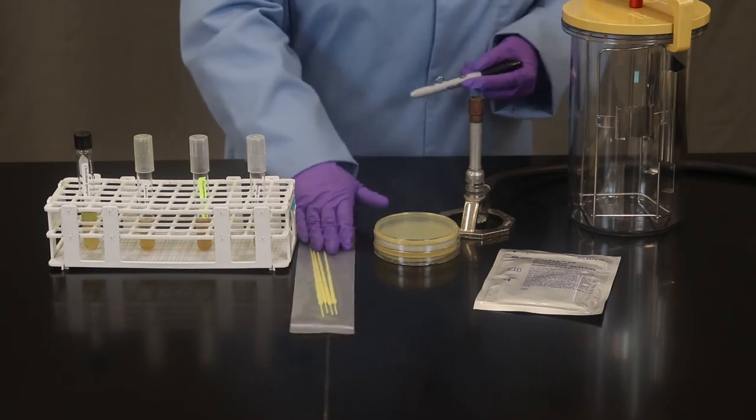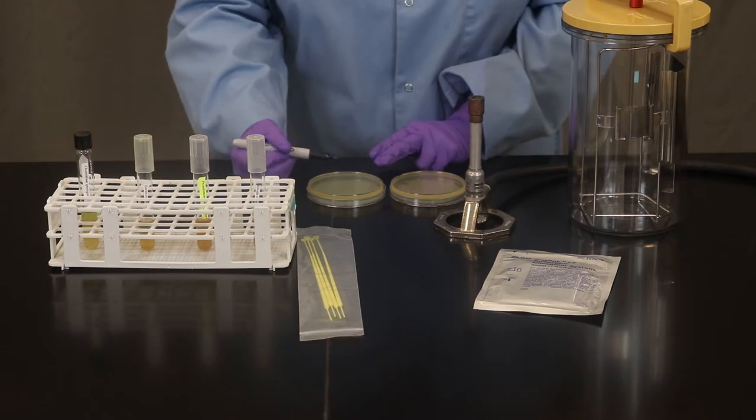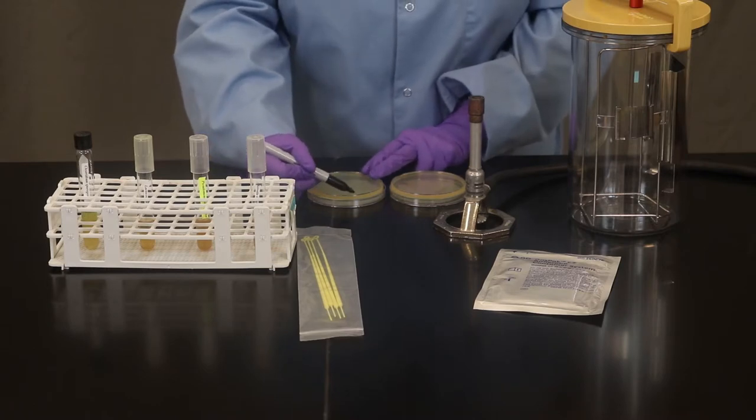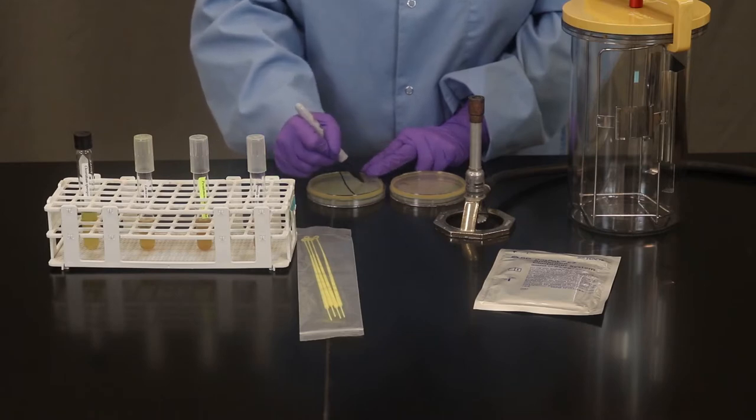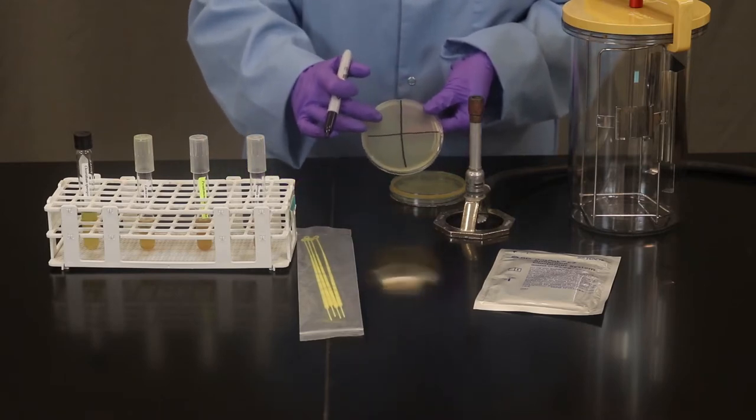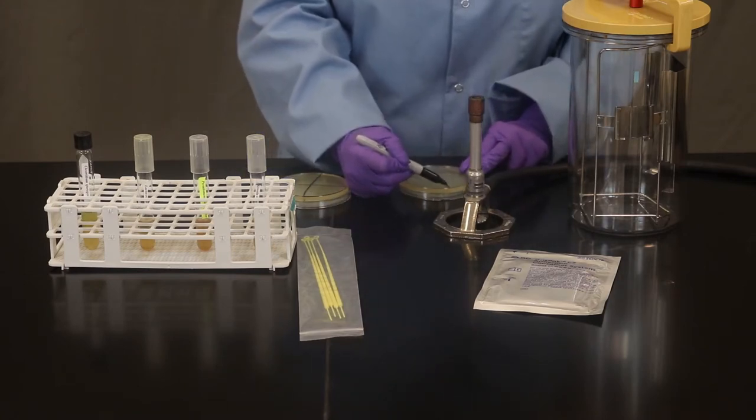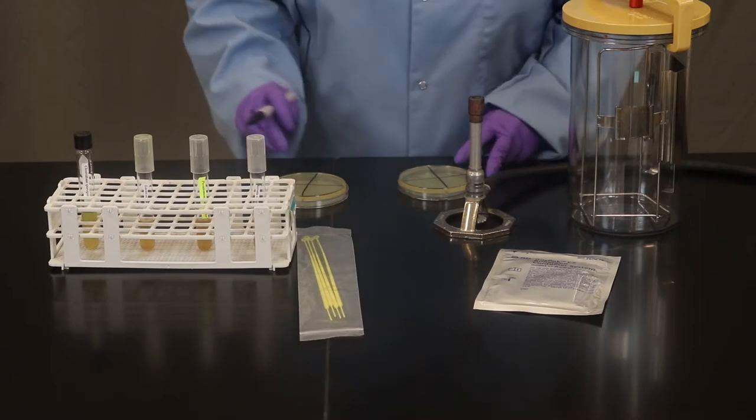Before we get started we're going to label our petri plates as follows. We're going to create four quadrants on our petri plate. So I'm going to create a big T essentially with four quadrants here on each plate. You can use a ruler if you want.